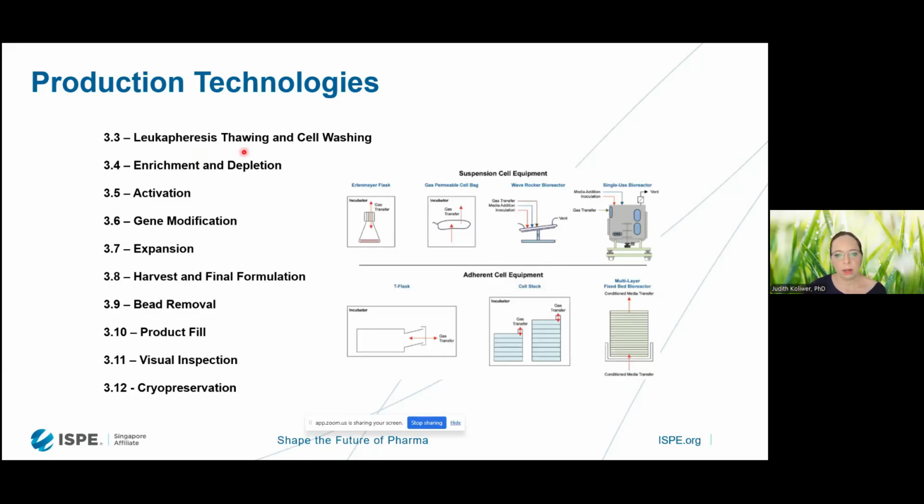One is the more traditional and a little bit less controlled way, where we are really putting our cells into a water bath or in a controlled environment. That is still done. It's not that we have not found anyone who would say that's the right process, but the majority of our discussions went around really controlled thawing processes where we are using equipment that in a controlled way increases the temperature by a certain amount of degrees over a certain amount of time.